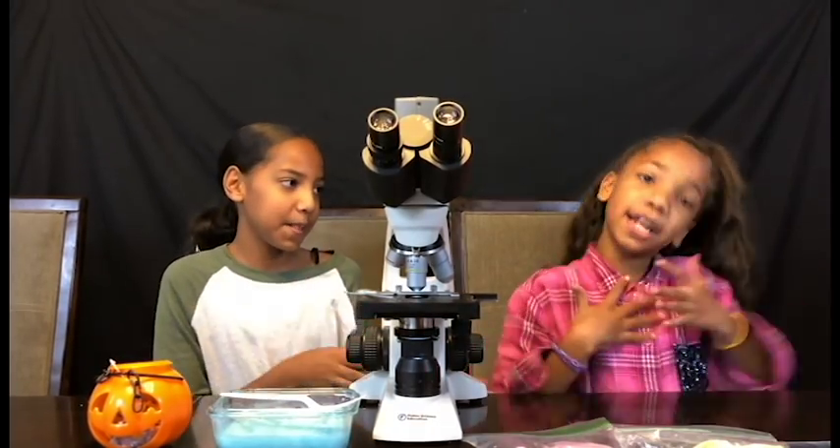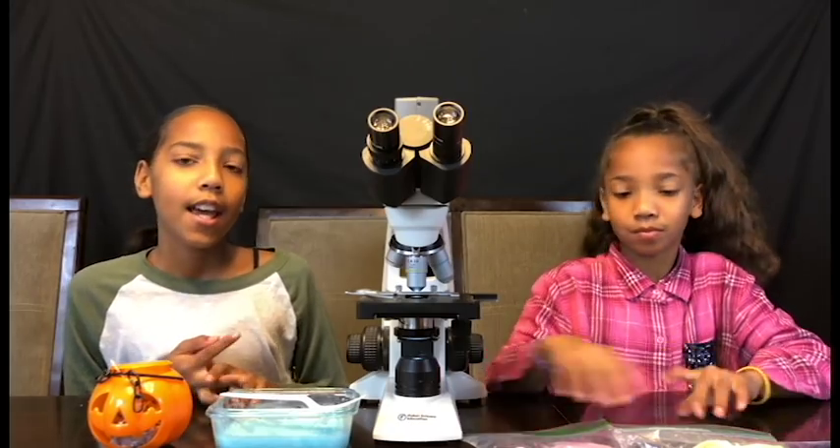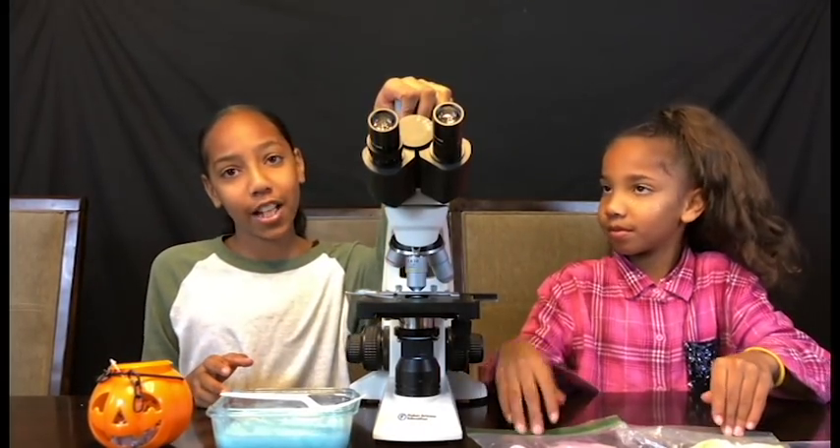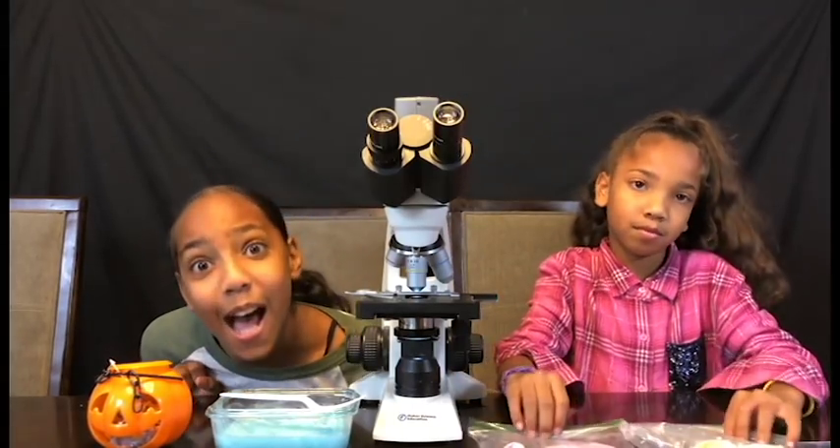Hey guys, it's Jasmine and Tanaya and we have introduced a new series. It's called How Does It Look Like Underneath a Microscope. Today we're gonna be testing out slime.